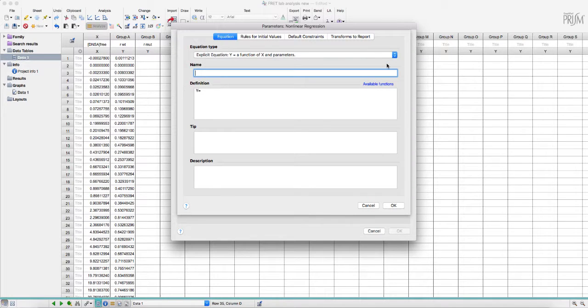Okay, so the Langmuir isotherm is not by default in Prism. We have to add it ourselves. And I also should note, if you're on a PC, this may look slightly different, but I think you should be able to figure out what you need to do. If you need help, let me or the teaching staff know.